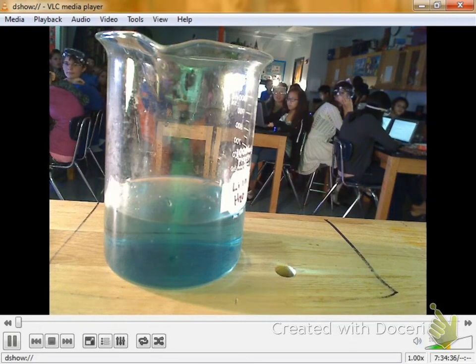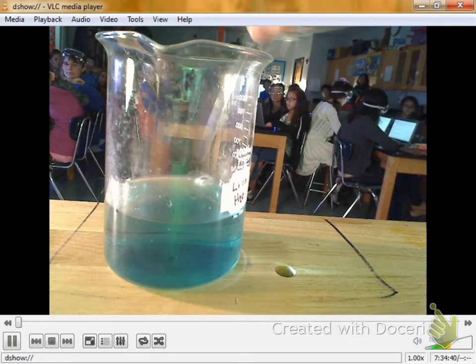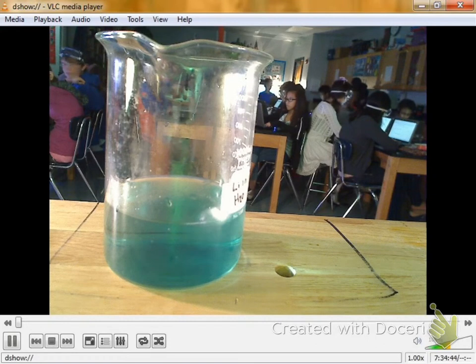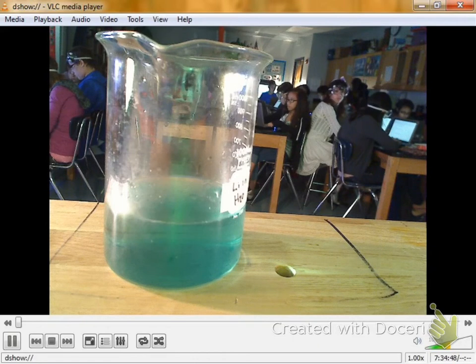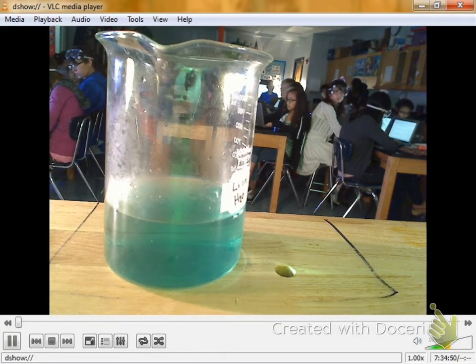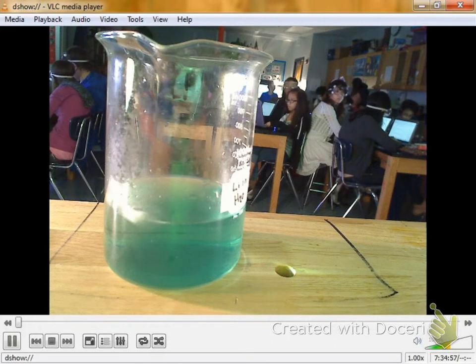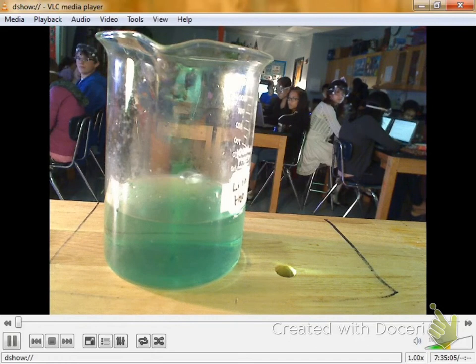Wow, check that out. Where is it? It's floating. Did it even sink at all? No. Lithium has such a low density, it floats. It's floating in the oil in this jar. And if oil floats on water, where do you think lithium's going to be? On the top. Yeah, it stays up there on top because it has a very, very low density.